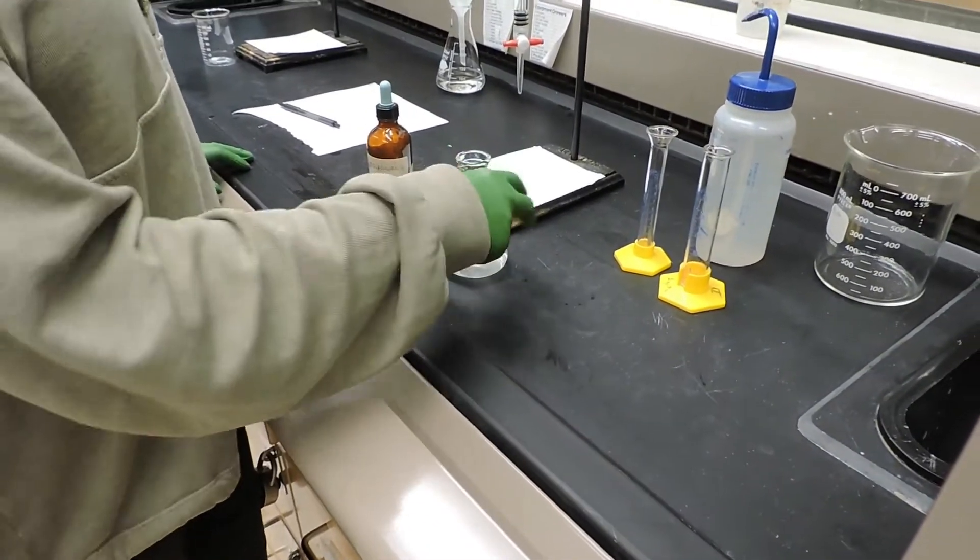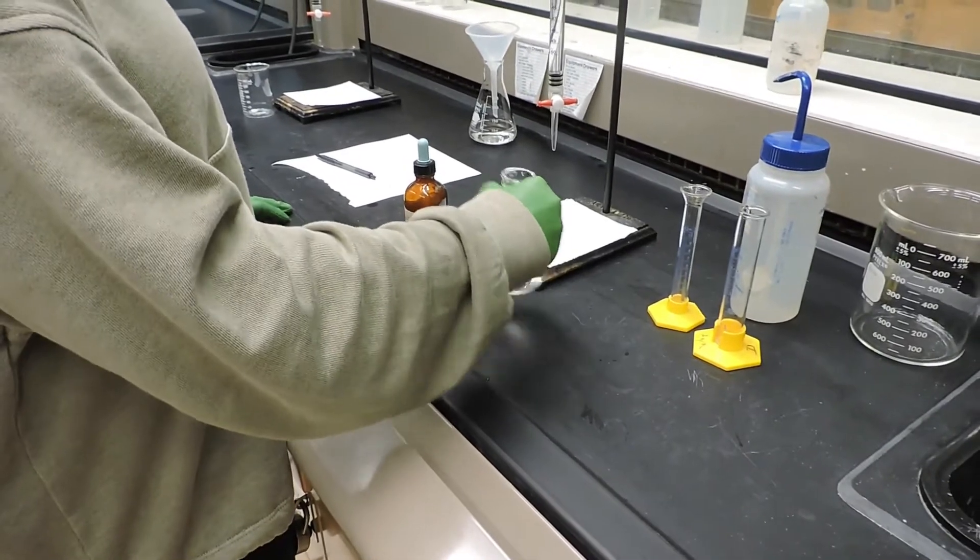Next we will add two drops of phenolphthalein indicator and mix well.